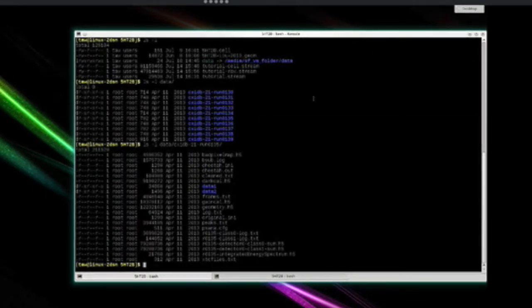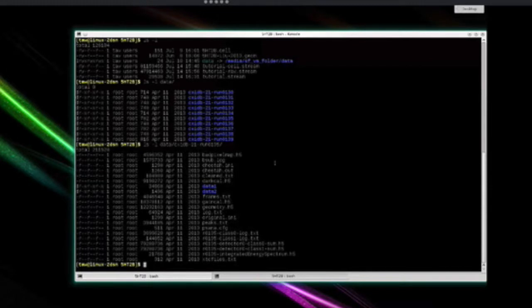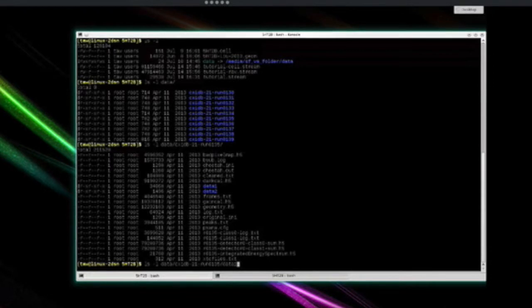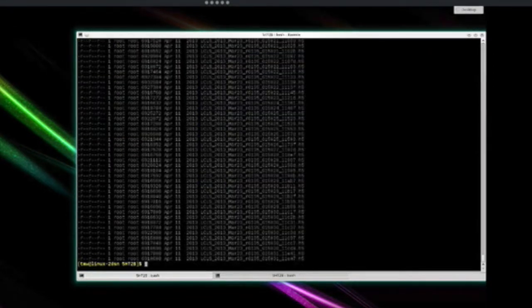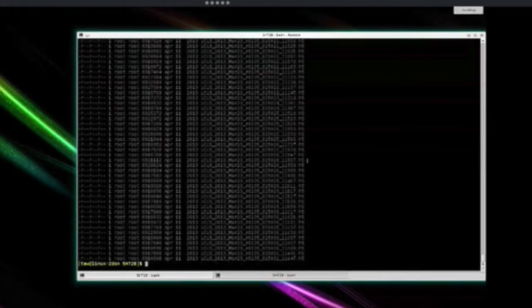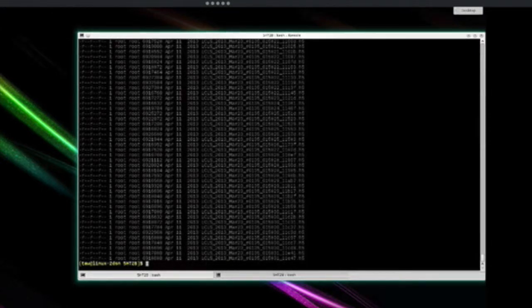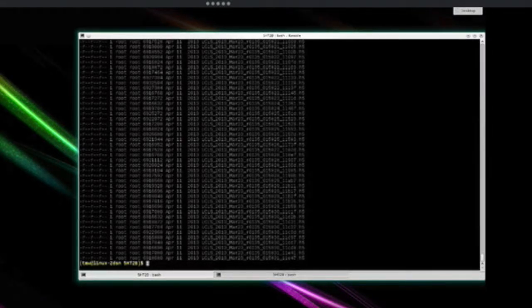What you see is some metadata and auxiliary files. So mostly these are configuration for the earlier processing stages. The real data that we want is actually in these folders, data1 and data2. You'll see there are a lot of them. So here's the files. These are the files we're mostly interested in. There's one file per diffraction snapshot, and they're in HDF5 format. So if you don't know what HDF5 is, it's a very common scientific data format. It can contain just about anything. It's hierarchical, it's easy to use. There are bindings for almost every language you can think of.